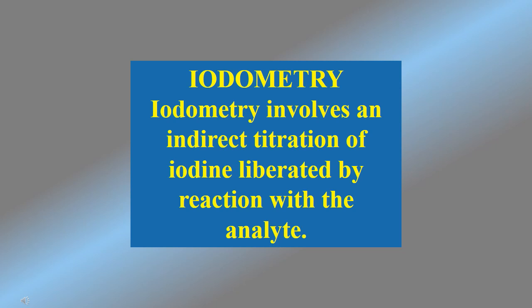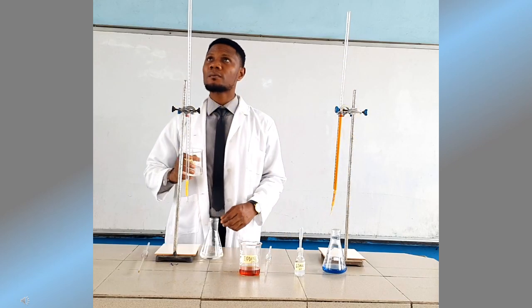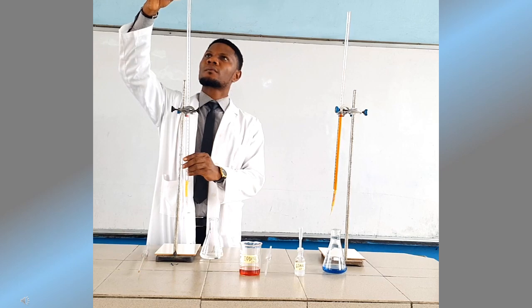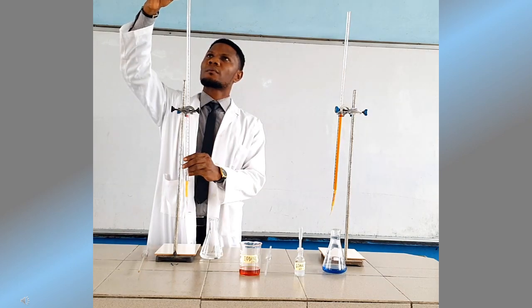In this method, the sodium thiosulphate serves as the titrant. As such, it is filled into the burette. Just as you could see right now, we're filling the sodium thiosulphate into the burette.